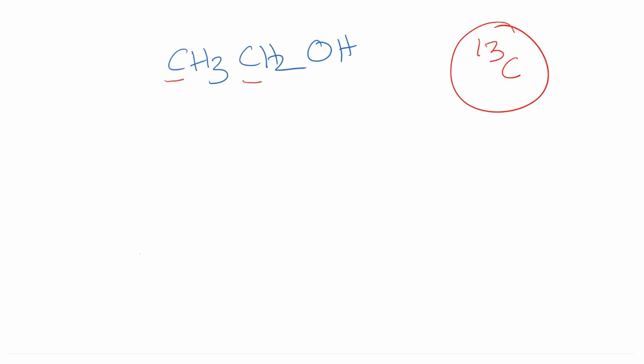Okay. So, I am just going to draw the NMR spectrum here, do not worry about the details of the scale, we will get to that soon, but let us say I have a scale of 0 to 200. Okay, and this is represented in ppm, we will get to that very shortly.